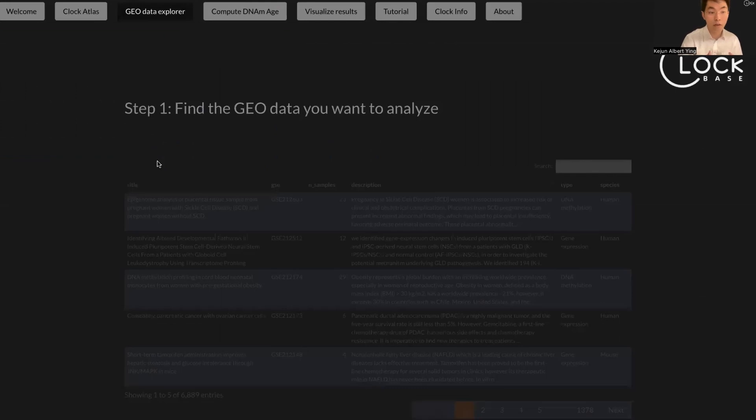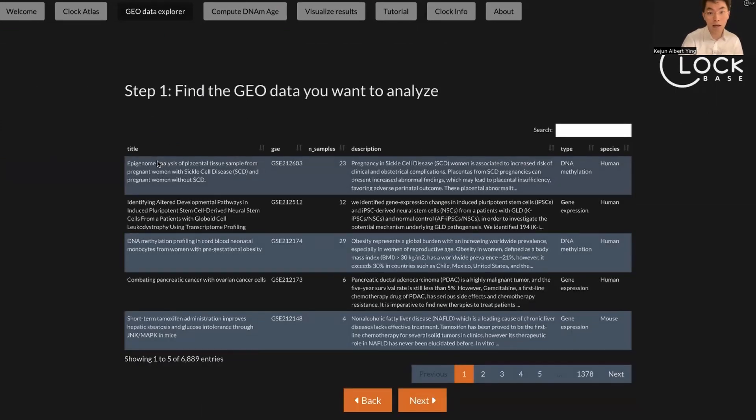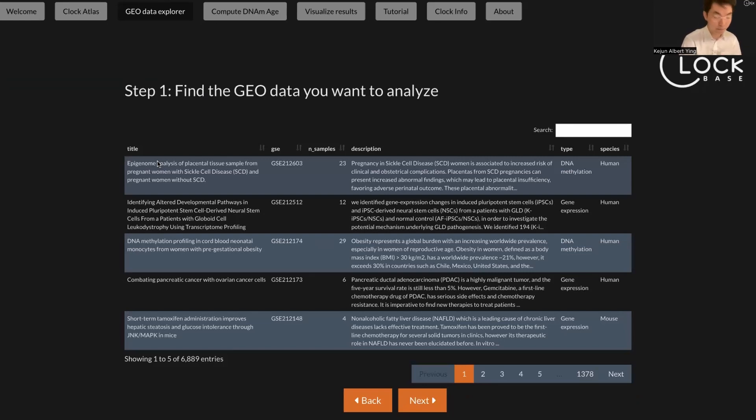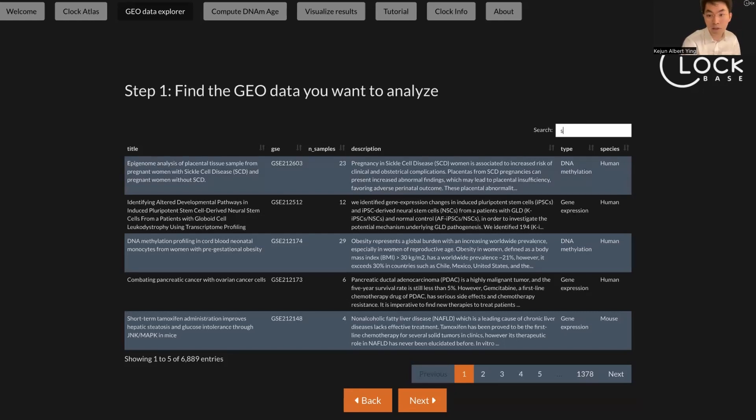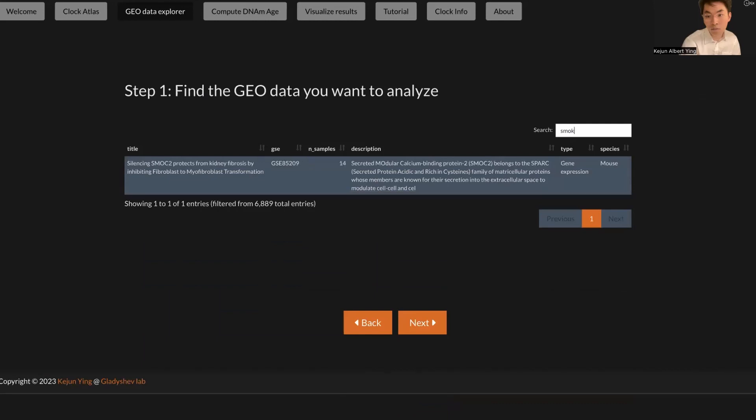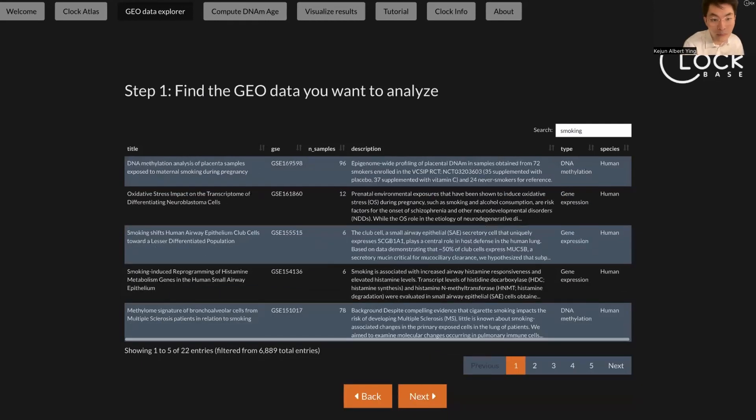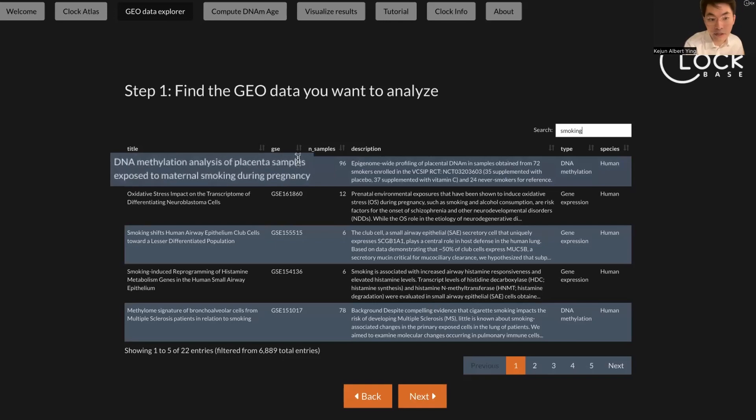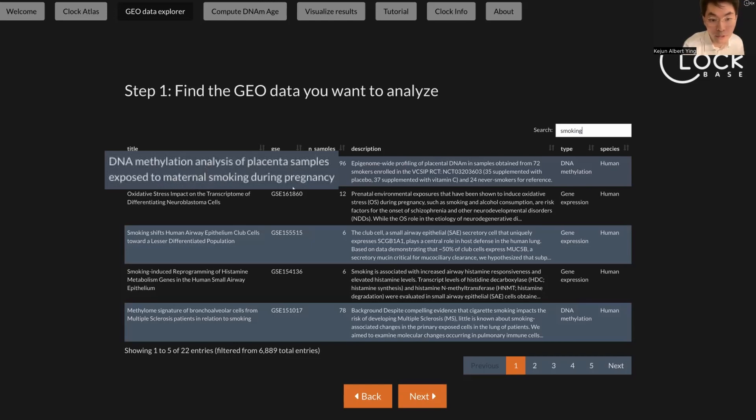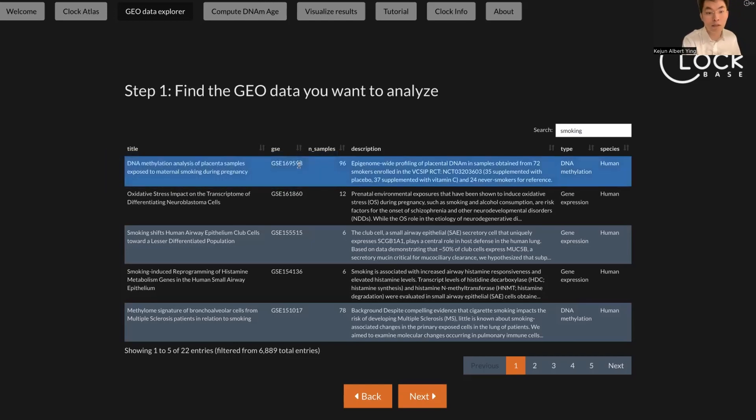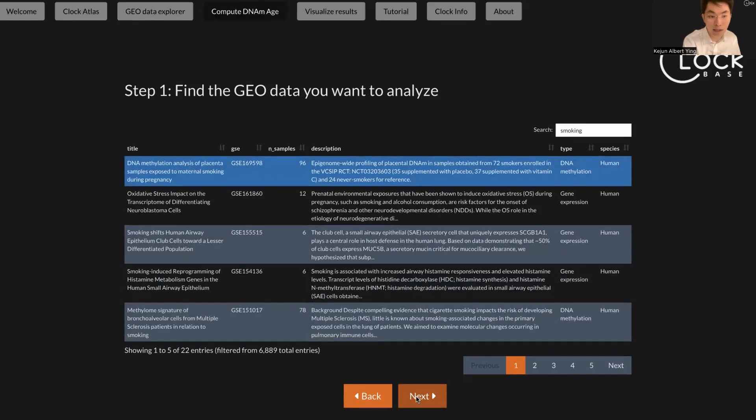After you have an overview of the database, the first step you need to do is to select which dataset you want to analyze. Just to demonstrate here, for example, you want to study whether smoking can accelerate aging. So here you just type in smoking. For example, the first dataset here is the DNA methylation analysis of placenta samples exposed to maternal smoking during pregnancy. So we just choose this dataset and go to the next step.